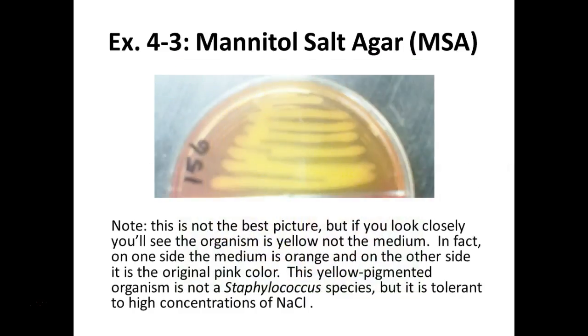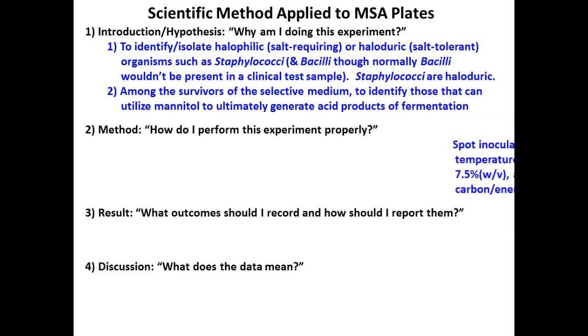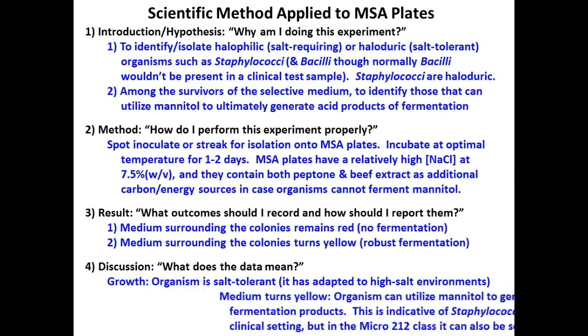This plate is another organism, and you can see it's kind of orange. So it's starting to ferment the mannitol. And definitely salt tolerant, right? You see all that growth. But it's actually not a Staphylococcus. But it's also not a clinical specimen. It's actually something you get from the soil. So, good place to look for your write-ups.